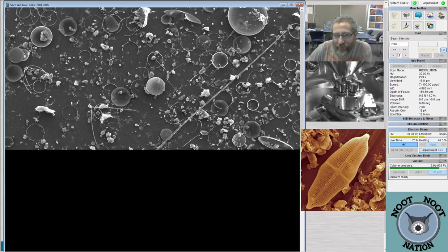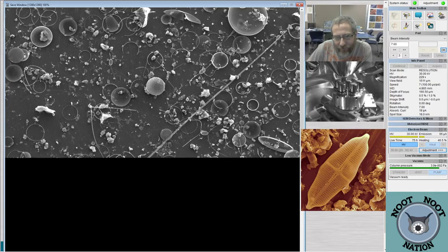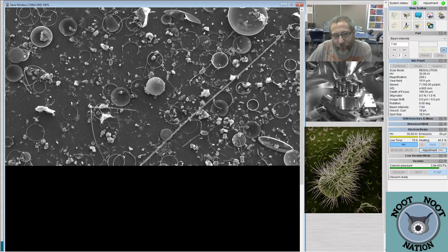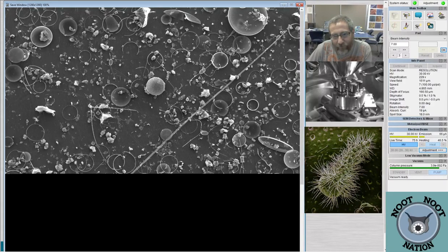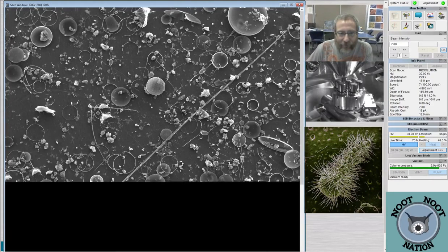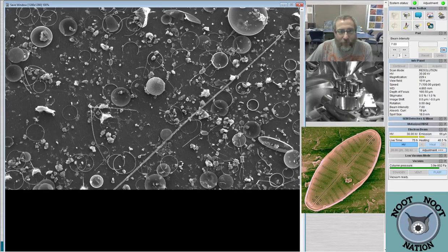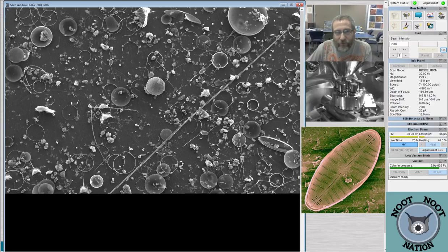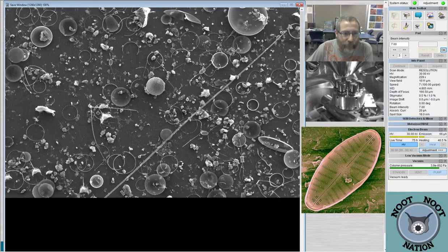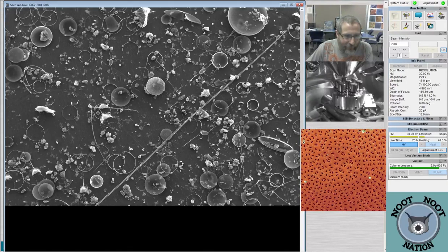Yeah, there's something else. Let me get rid of this. I don't think you guys can see it, but there's junk on my screen. There's something else down here, which may be the Scoliopleura? No, I think it's actually just this thing. But we're looking at the inside of it, and this is the outside of it. It's on its side here, actually. And this one, I think, is the inside view of that thing, based on size and shape. This is a really interesting looking thing.